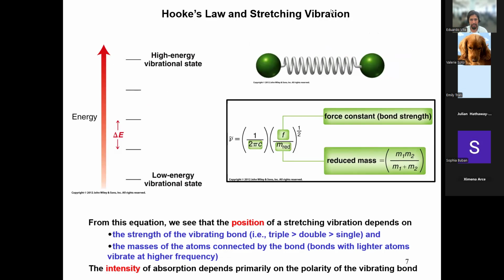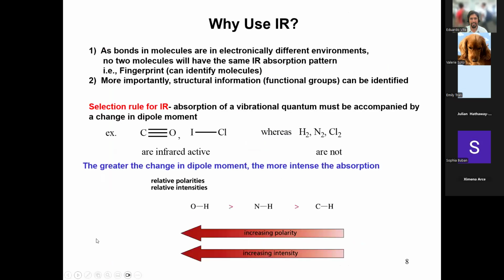Yes, I have a question on the chat. So wavelength and energy are inverse, but wave number and energy are proportional. Correct. That is correct. Yes. Good question. All right, moving on to the next slide.